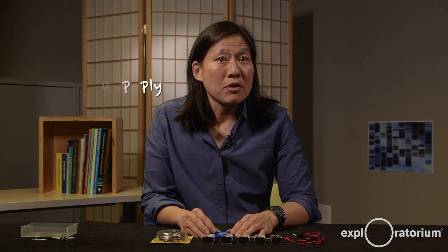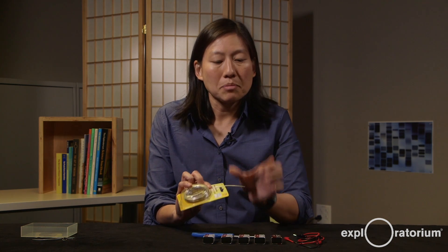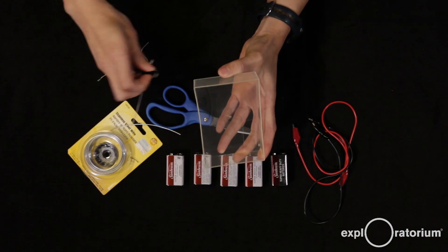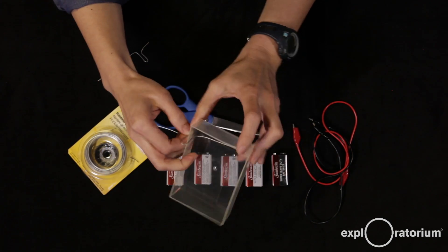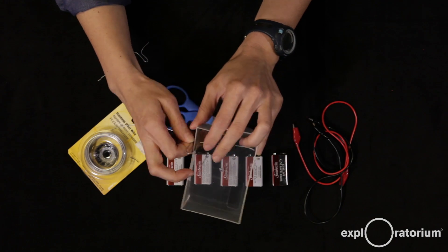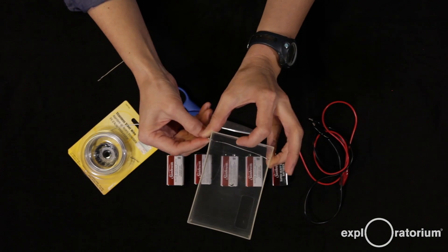While your gel is solidifying, you can make a power supply to provide the electric current that will move your samples through the gel. You need a source of power and electrodes. For electrodes I like to use stainless steel wire because it's non-reactive. Cut pieces that span the width of your box, with a little extra so you can hook them onto the side to keep them in place. You can tape them down if you're worried about movement. You need two electrodes — one for the positive terminal and one for the negative terminal.